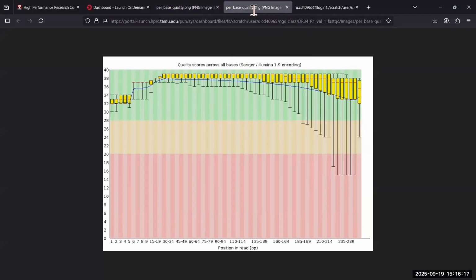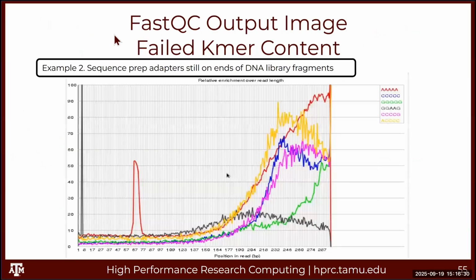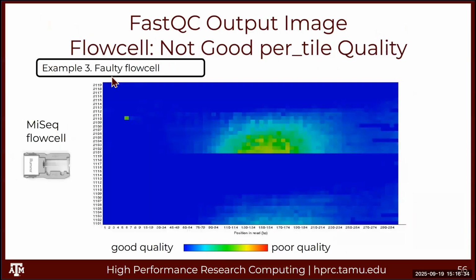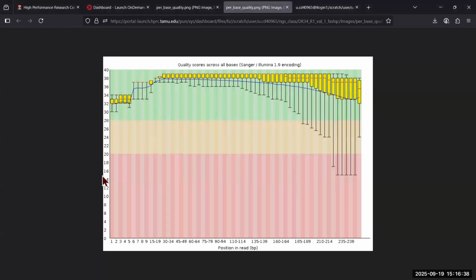So if you download data from the web, you'll definitely want to run FastQC before trimming to make sure, because people can load anything up on the web. I mean, somebody might upload this data on the web, right? So you need to know what you're getting into. All right. So everybody got this.